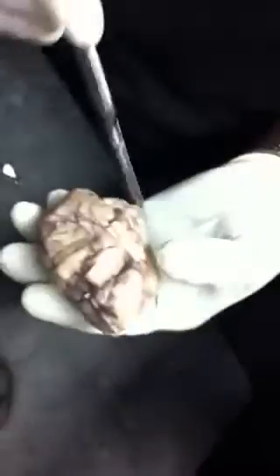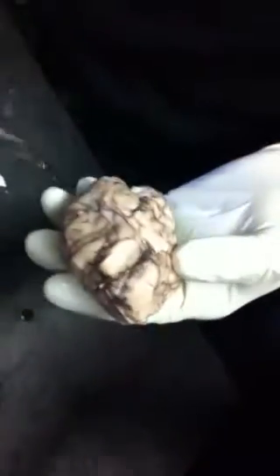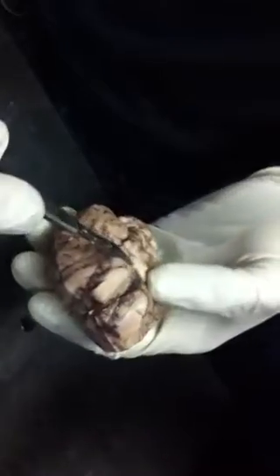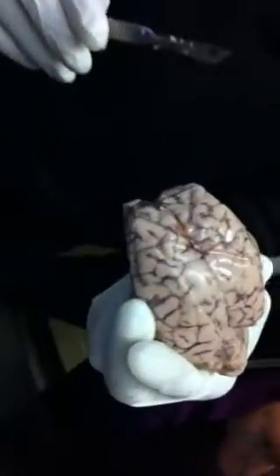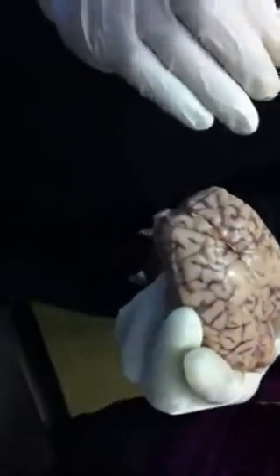And the optic nerve is what? The optic nerve has been cut away. It came from here, and the two of them joined to form the optic chiasm. Now this is your cerebellum at the back. So this is the front. This is the back. This is superior. This is inferior. Let me just hold it this way.